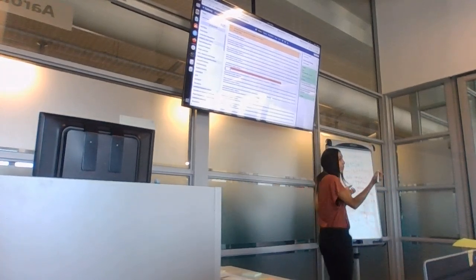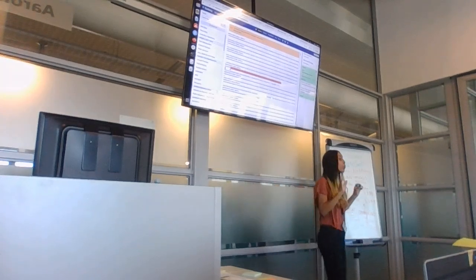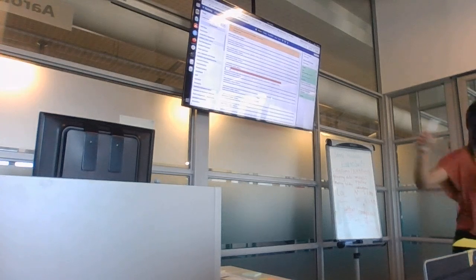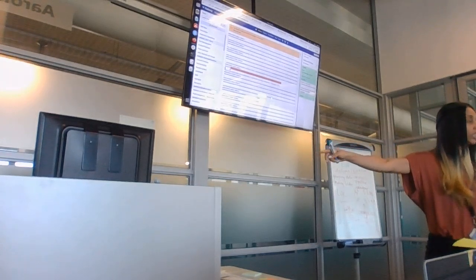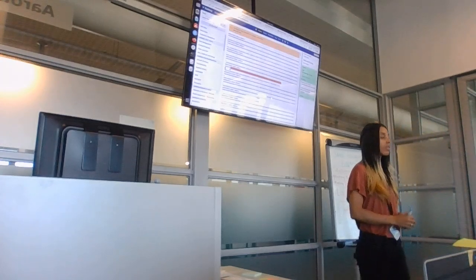So eventually, technically, even all my reads, if this is the reference file, may overlap most of the genome. Maybe there'll be gaps there. Now, I'm not saying this is doing any consensus, but I'm saying all of it combined, you're not looking at one read. This file should not be called a read. It's reads. So it's called a forward and reverse file. It's not a read. The forward will have 80,000 reads.